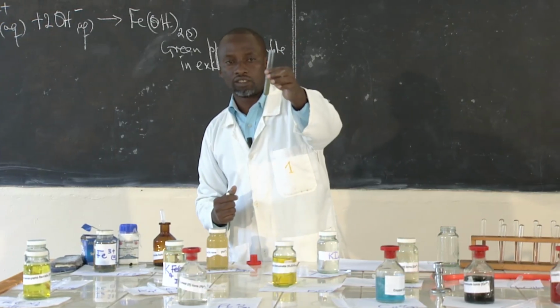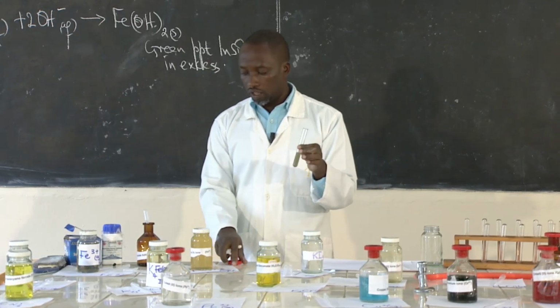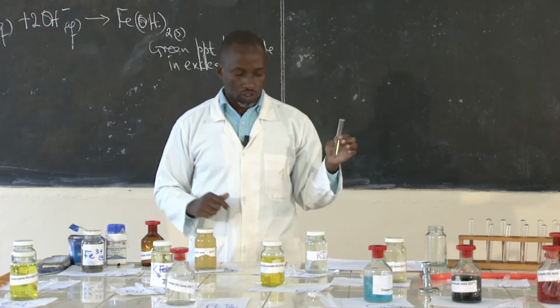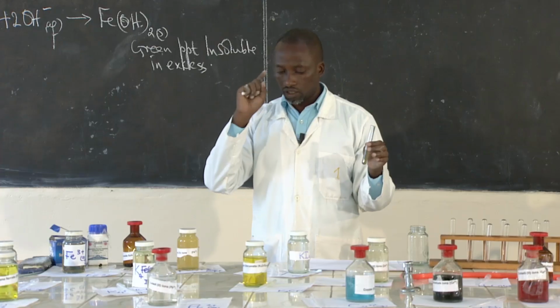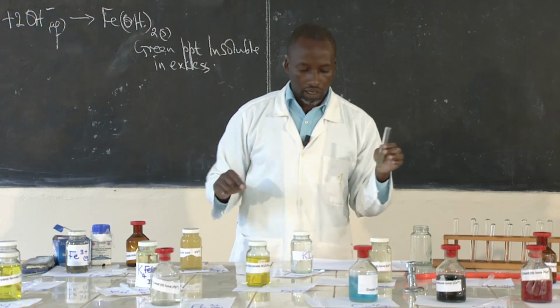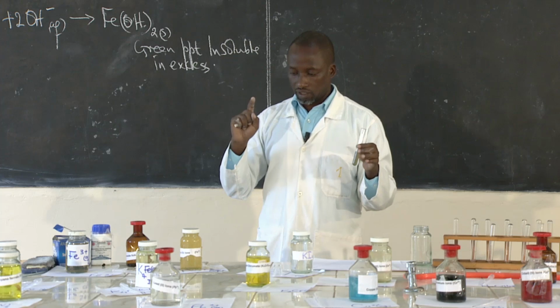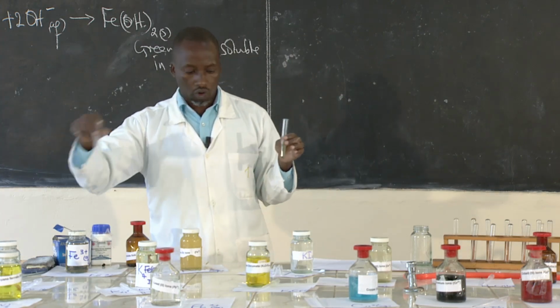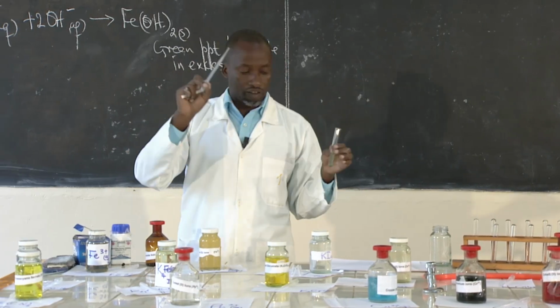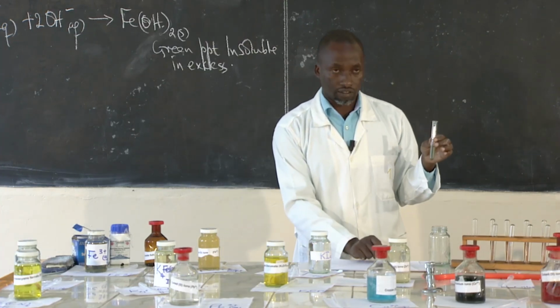So that's what happens. So we are just going to look at the same solution, to see the effect with ammonia solution. Please take note, we have different droppers here. Whenever you are carrying out an experiment, there are guidelines you need to remember always. Don't interchange these droppers, because you'll get wrong results. So be careful whenever you are carrying out what we call the qualitative analysis.